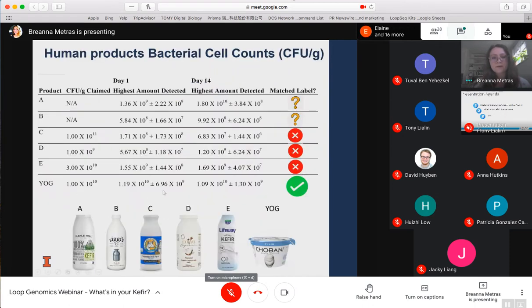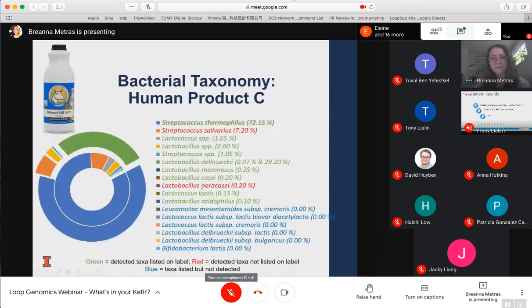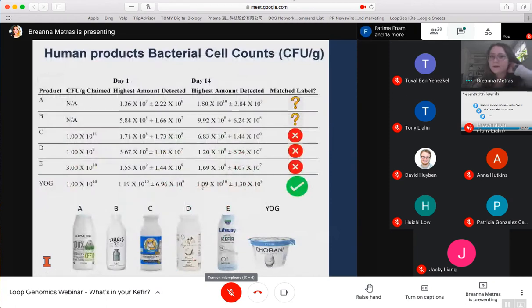So these are the results for the human product cell count. As you can see, we have the products listed on the far left, and then the claims that they had posted on their label next. Then we have the highest amount detected on day 1, highest amount detected on day 14, and then the final result is if it passes or does not pass.